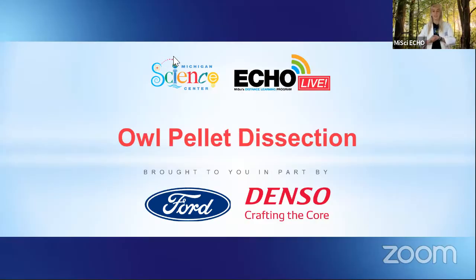They're real interesting, and this is a great dissection if you're interested in things like paleontology or life science, because we're going to cover a few different themes today using these different programs. So today we're dissecting an owl pellet, which again is the regurgitated remains of different things that owls have eaten. So before we get to the dissection itself, let's first talk a little bit about food webs.